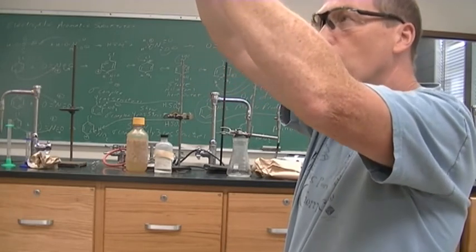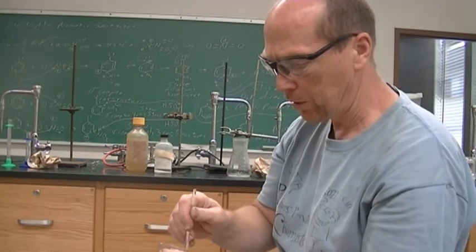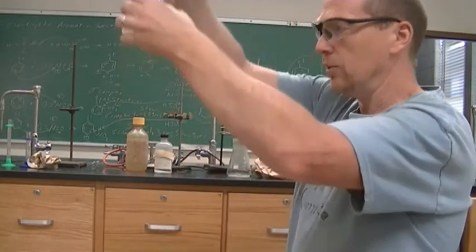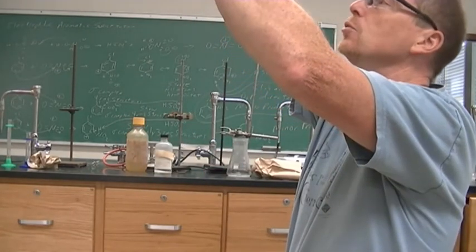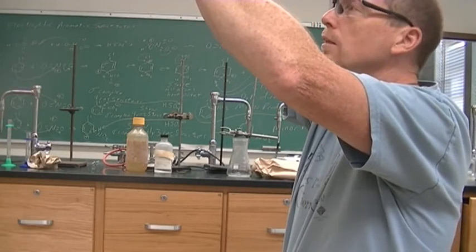Because if it's an oil, the oil will go through the filter paper. We do not want that to happen. We want the oil, if it is an oil, to crystallize into solid particles so that it does not go through.